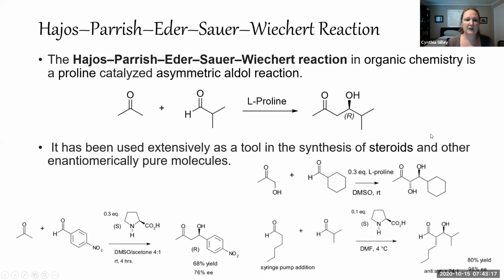Okay, so the reaction that's shown in the video is, even though it's called an aldol condensation reaction in the video, actually an aldol addition reaction, first of all.